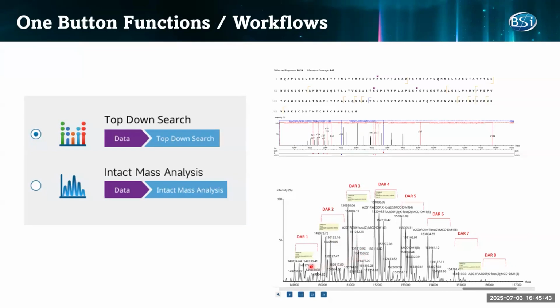And with this, we can see, as we expected, this ADC is very complicated. They have different DAR values, even though very often we measure the average DAR value, for example 3.4, but they have different proteoforms. Considering glycan profiling, they have very complex proteoforms.